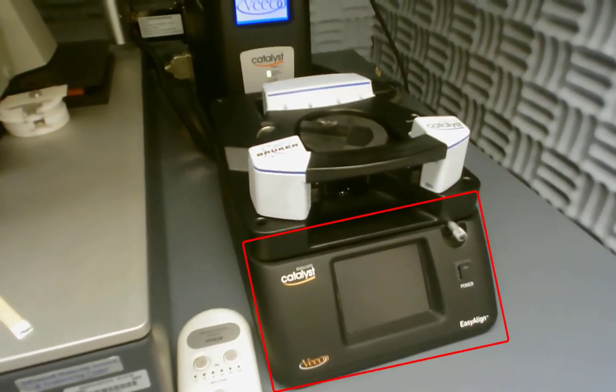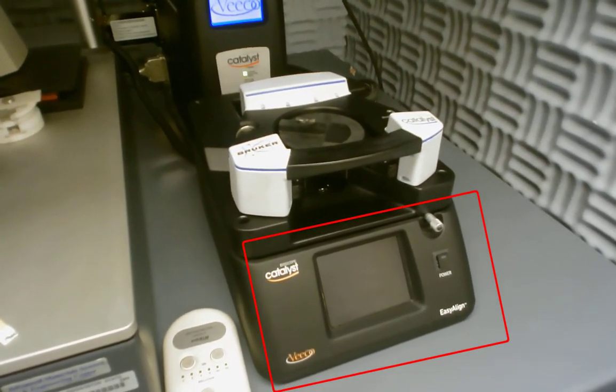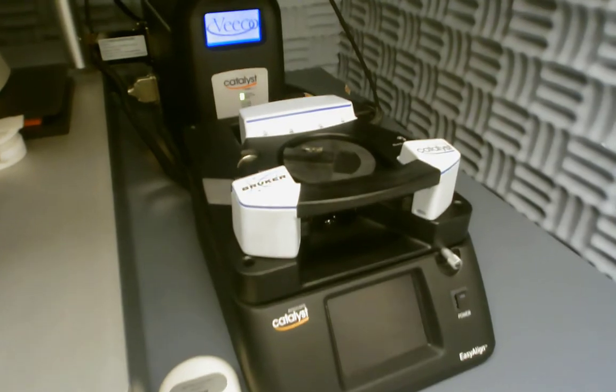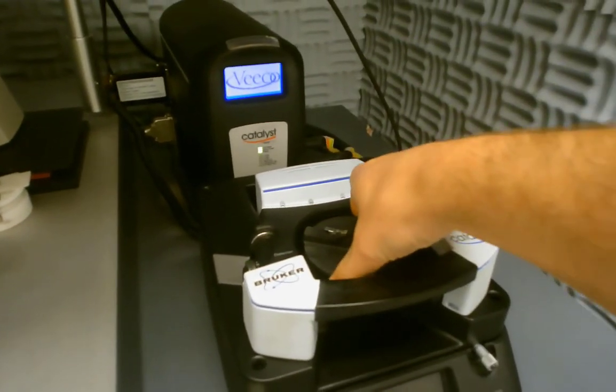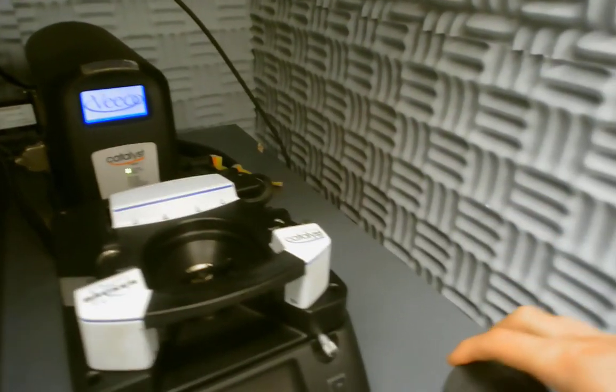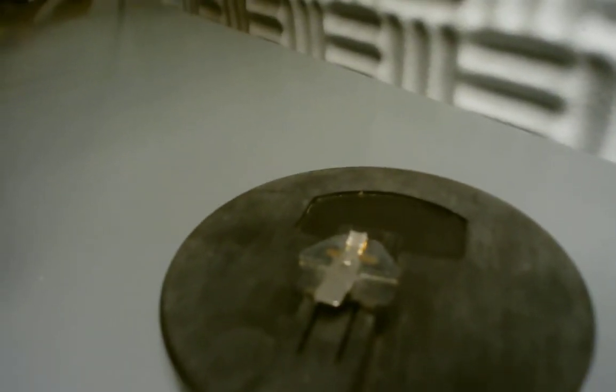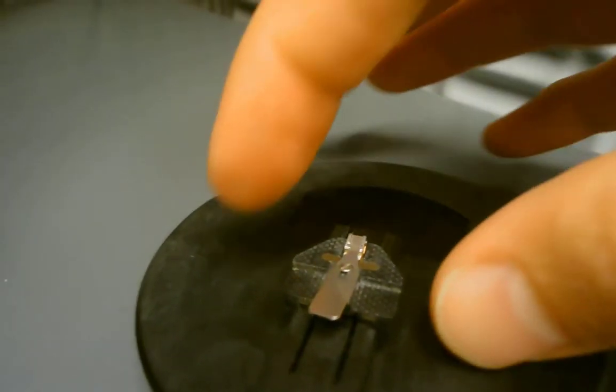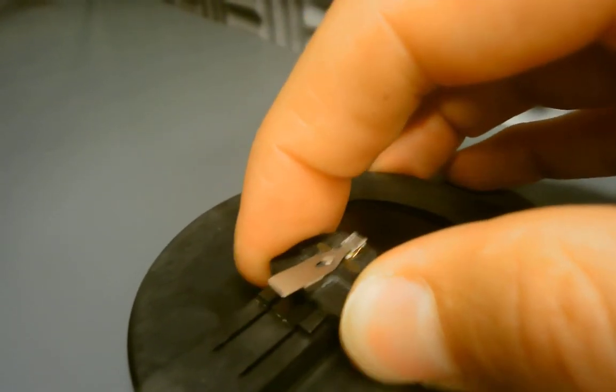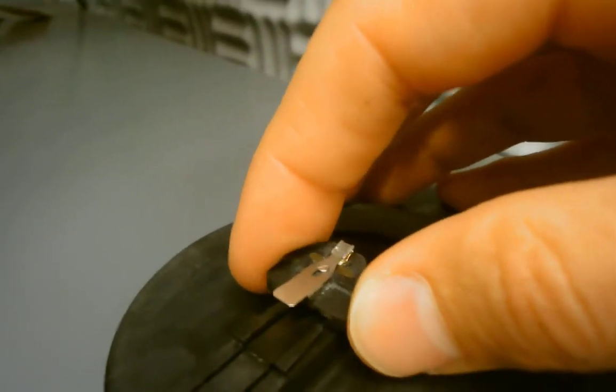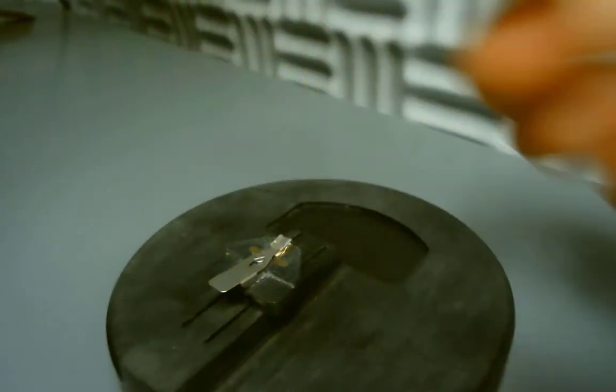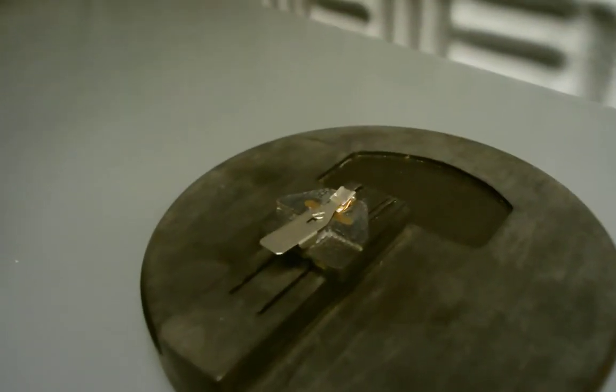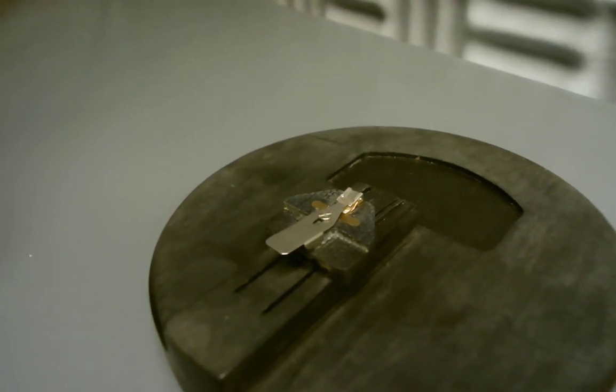Down on the right we have our easy align system for lining up the laser and the cantilever. The tip will be mounted, I'm going to refocus this. The tip will be mounted here. So this tiny little piece is the tip holder. And it's mounted on this black disc just because it's so small that this helps us handle it without dropping it.